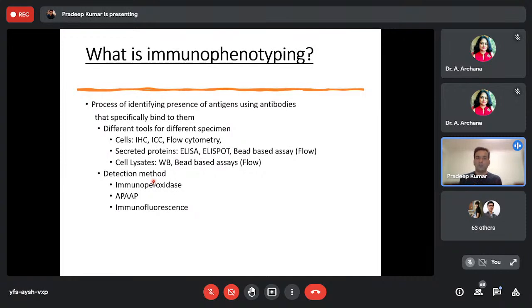So you look for the phenotyping of your cells, like you look for different kinds of antigens using antibodies, and that's called immunophenotyping. And flow cytometry is not the only tool for doing that. There are other tools as well, but because this gives information at the single cell level and gives you absolute information in terms of statistics, like in terms of percentage, it becomes really important.